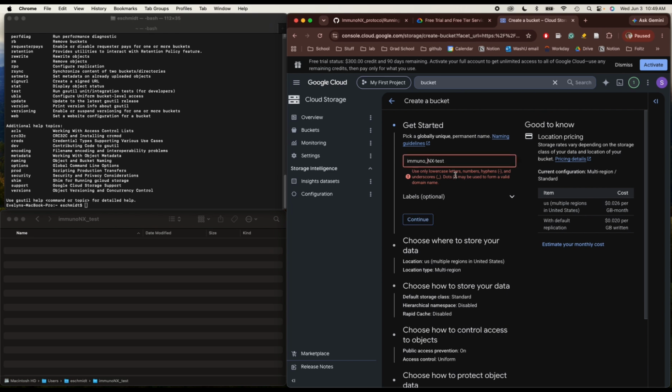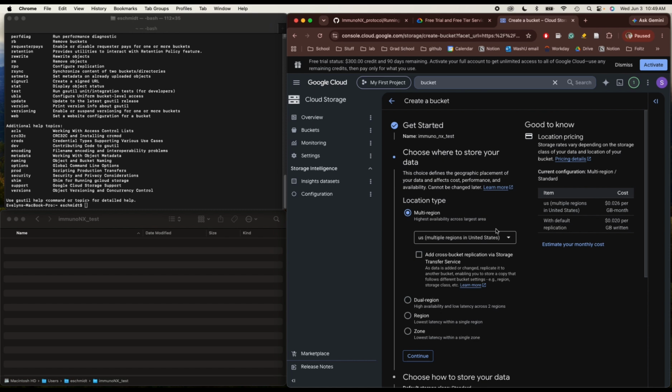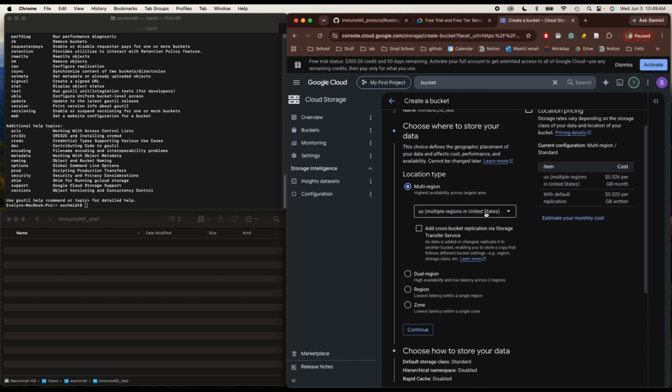Oh, underscores. Only lowercase letters. All right, sorry. Okay. So, geographic location of the data.